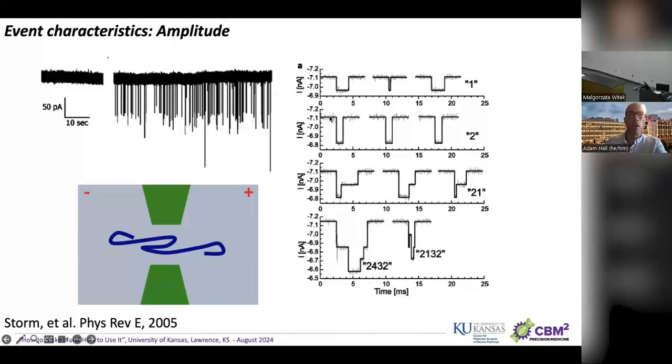However, you sometimes see spikes that are twice as deep, but on average briefer. They don't take as long to go through. This is all because double-stranded DNA is a flexible polymer. There's no reason why it has to go end to end through that hole. It could fold over on the way through. So these, what we call two events here, are perfectly folded molecules. They're folded over exactly once, but they don't have to be perfectly folded.